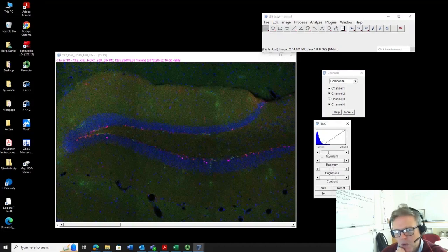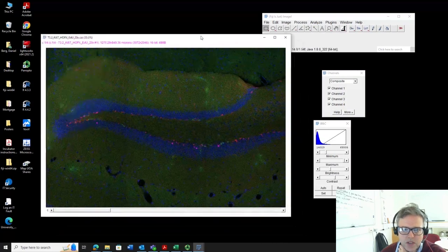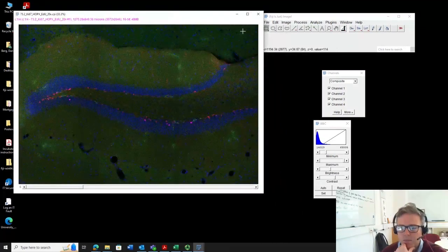And remember that if you do any adjustments here, you need to make sure that you do the same adjustments on the control and the treated group. The best thing is if you don't need to do any adjustments to the pictures.